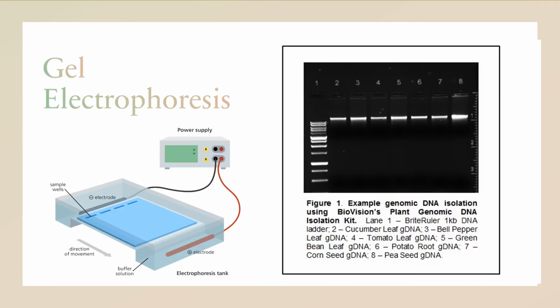So just now, the white strand that you see in the tube is what is visible to your eye. And then we want to see whether the DNA that we extracted is intact or not. Then we can see from this picture right here when we run our gel electrophoresis. So this is a gel electrophoresis.